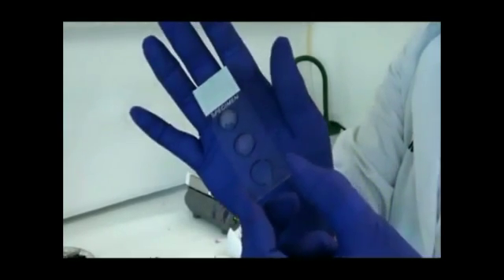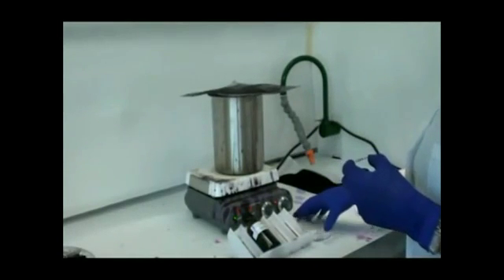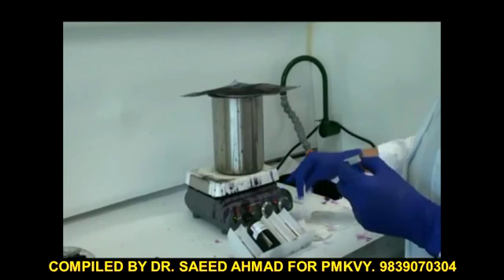Application of the primary stain will be done in a fume hood. Here's my bacterial smear. I have 3 smears on the slide. One is a known acid fast, one is a known non-acid fast, and then in the center I have an unknown.